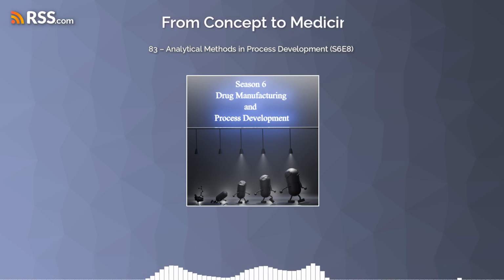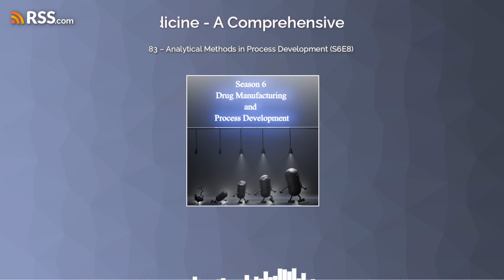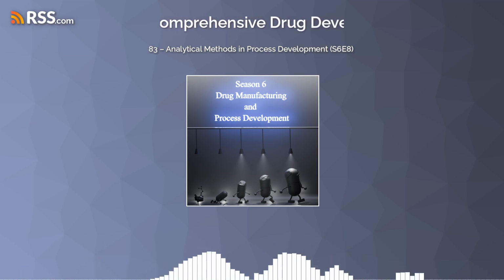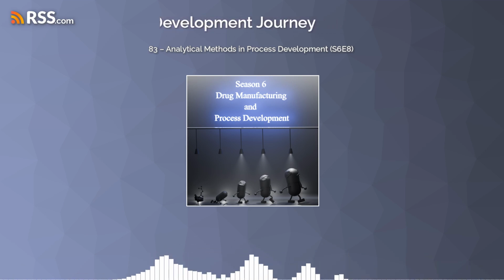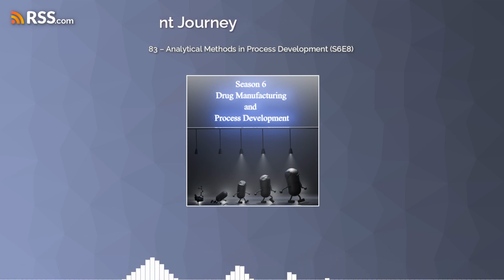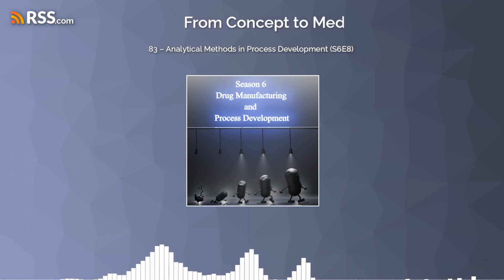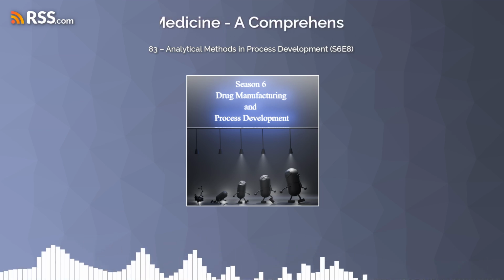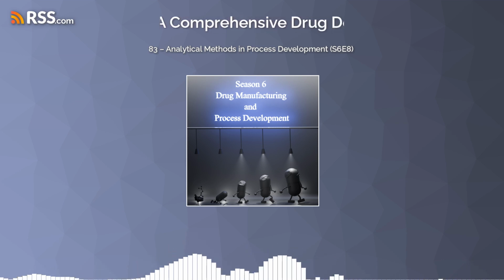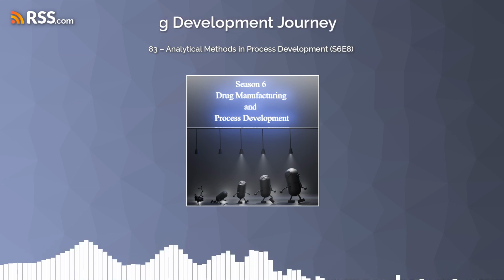They also noted that they saw changes in the color of the solid depending on the isolation techniques they used. Interesting. So while that was initially just a visual observation, if they needed to, they could have quantified those color differences using spectroscopic methods, which would have given them yet another analytical handle on the quality of their material. So HPLC gives you that definitive number on the purity. Exactly, and it meets those regulatory standards. Right, because everything needs to be documented and proven.